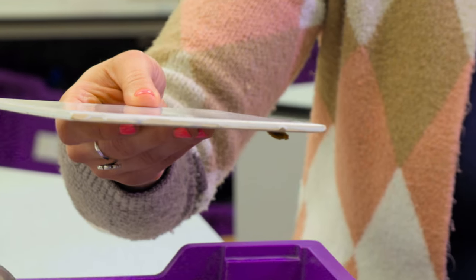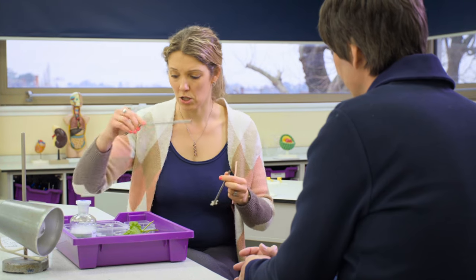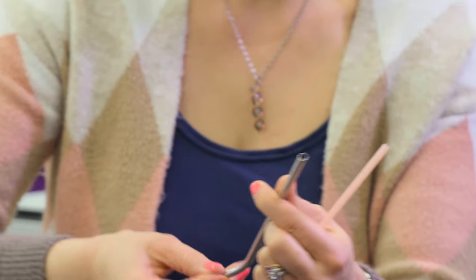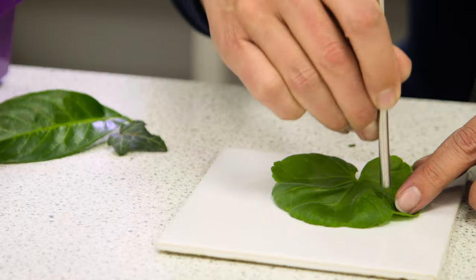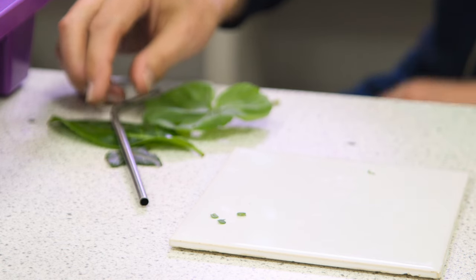Then you need your white tile so you can cut your leaf discs out. When cutting the leaf disc, you have a few different options. Lots of schools will have a cork borer. You can use a metal drinking straw, or you can hole punch as well. What you want is three or four leaf discs which are as similar as possible.